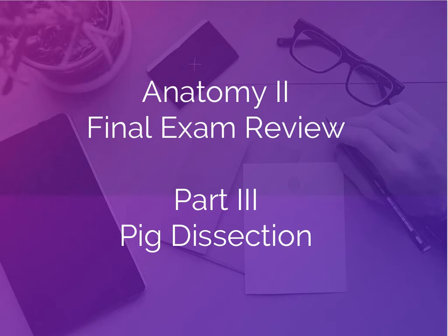All right, here we go, the final review. After today's review session in class, you probably don't even feel like you need this one, but if you do want a little blankie, here's your pig dissection.